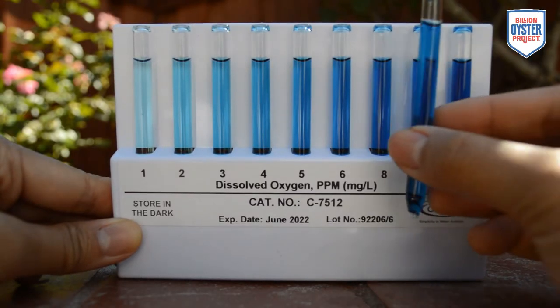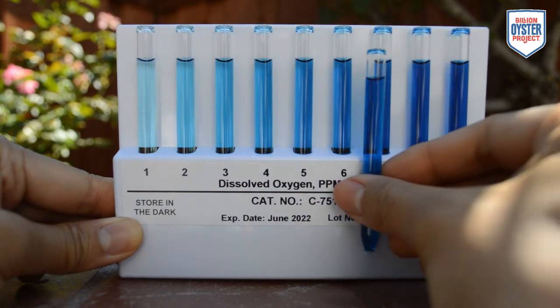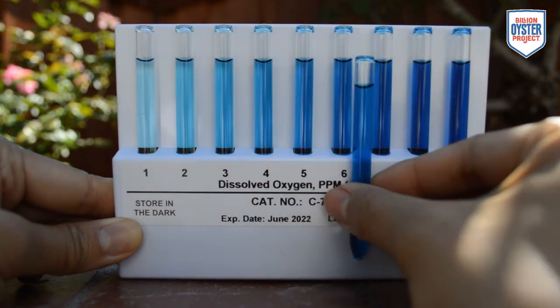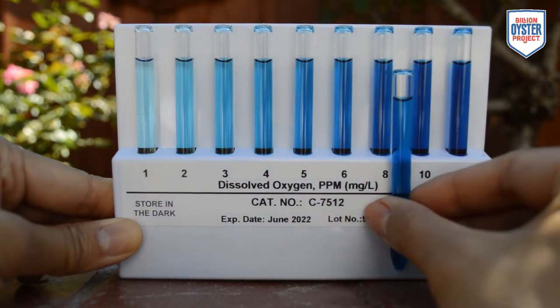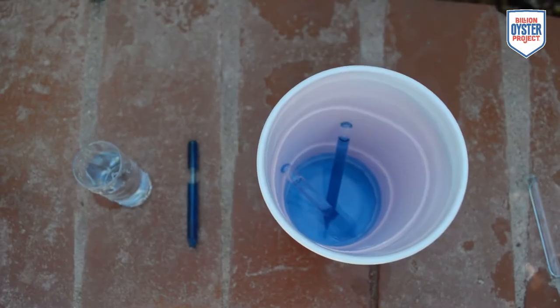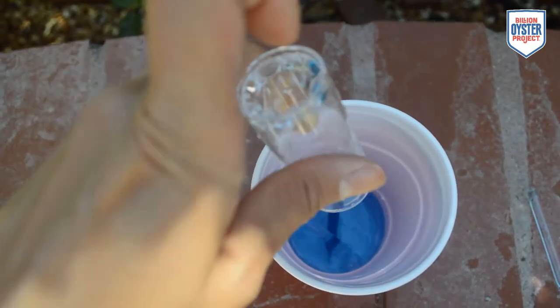For my observations, I prefer to take the comparator out of the black case. Compare your ampoule to the ones in the comparator. I recommend trying out different lighting situations to help you get the most accurate reading. Record your observation in parts per million, or milligrams per liter. Dispose of the remaining sample in your waste container along with the used ampoule.